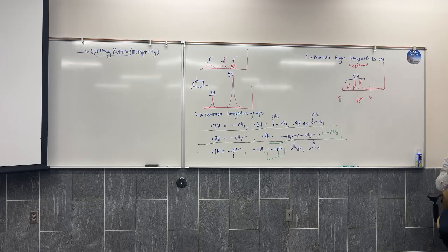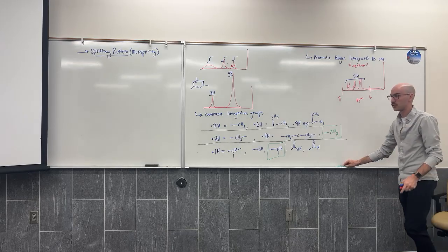Which, when you think about it, means that one type of hydrogen nuclei is giving off different combinations of frequencies because they're giving different chemical shift, like different ppm values, but they're all coming from one signal. This is probably the hardest part of NMR to even explain. And I don't think that I can really do a good job at it.